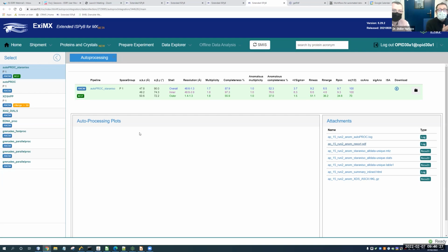So if there is anything you want done differently, like for example the radiation or the number of photons you want to deposit, all this kind of stuff, let us know. Obviously, you have to tell us a bit in advance because that's not something we will be able to change in 5 minutes, especially if it's a bit tricky. But we are definitely more than happy to do it and fit exactly what you want and the way you want the experiment to be done.